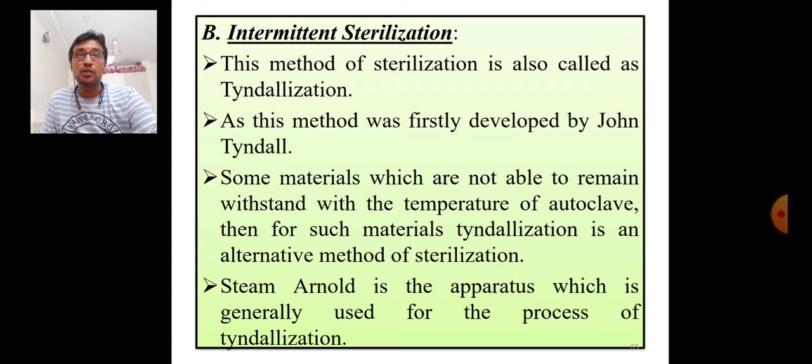Because this method was firstly developed by John Tyndall. John Tyndall is one of the microbiologists who developed this particular method of tyndallization or intermittent sterilization. Some materials are not able to withstand the temperature of the autoclave. For such materials, tyndallization is the alternative method of sterilization.